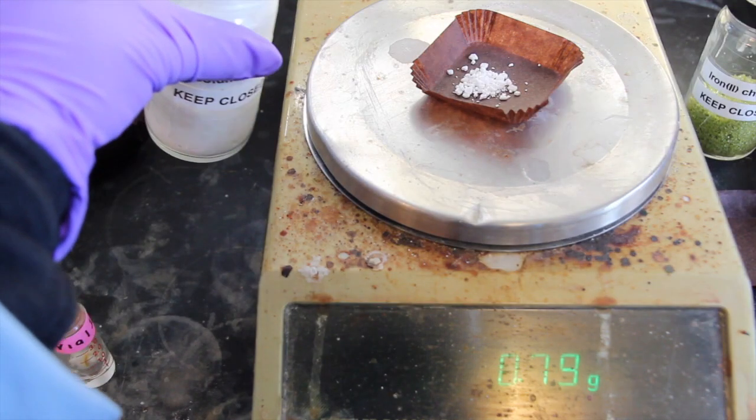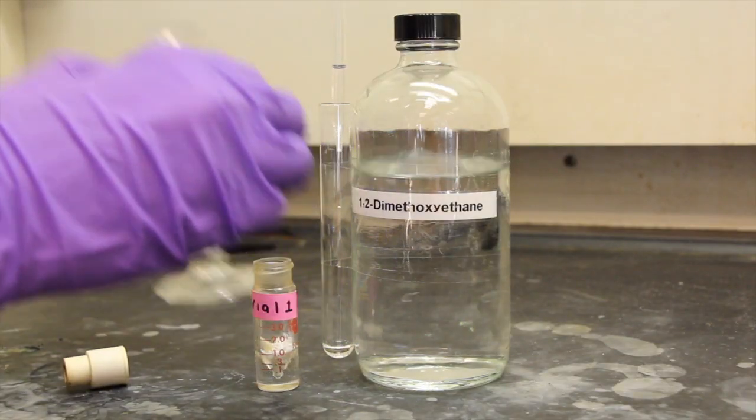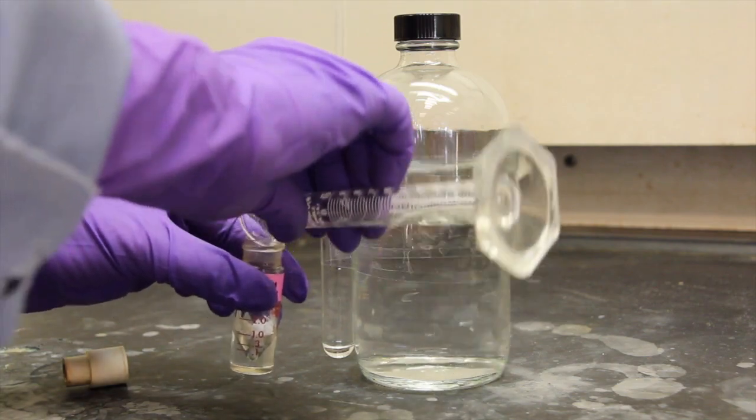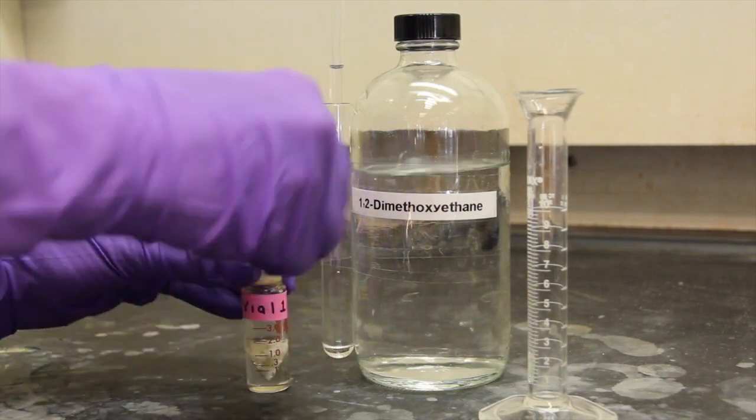Begin by placing 0.75 grams of finely ground potassium hydroxide and 1.25 milliliters of dimethoxyethane into a 5 milliliter reaction vial equipped with a spin vane. Quickly cap the vial with a rubber septum.